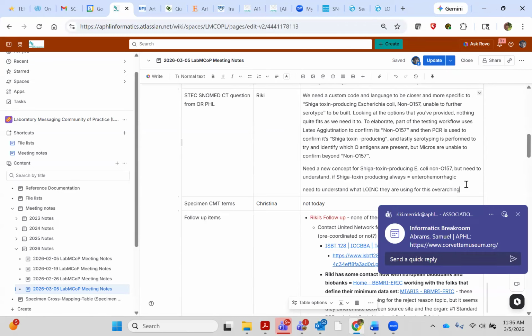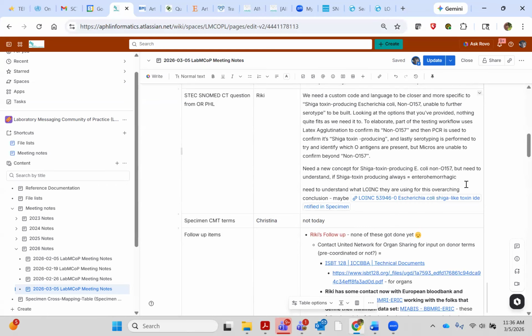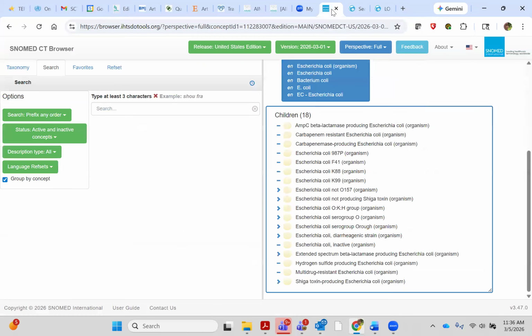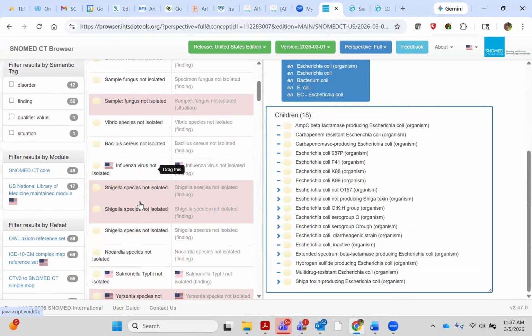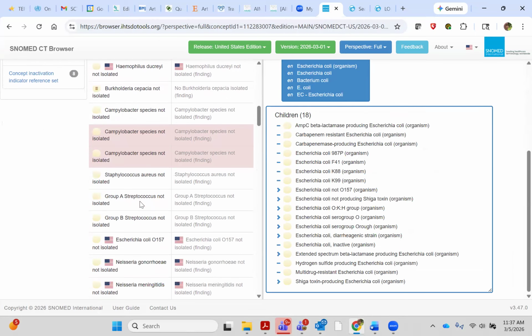A great example is, okay, the lab will report out their triglyceride level or their cholesterol level. So it'll be cholesterol, and then you'll have the numeric. The physician on their side will say, oh, this patient has hypercholesterolemia, and they'll pull it from the findings hierarchy. They'll put it on the problem list in that part of the functionality on the EHR. And that's kind of the distinction. We don't make that clinical assessment, if you will, because we're not clinicians in the laboratory from the sense of a physician diagnosing a patient.